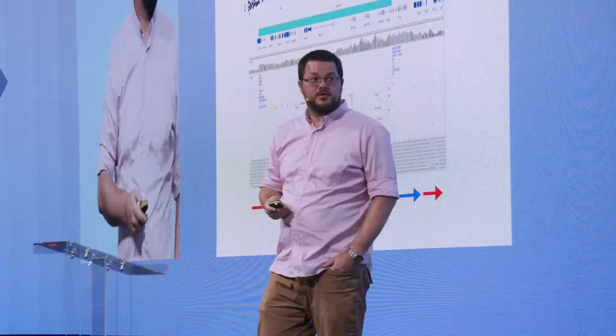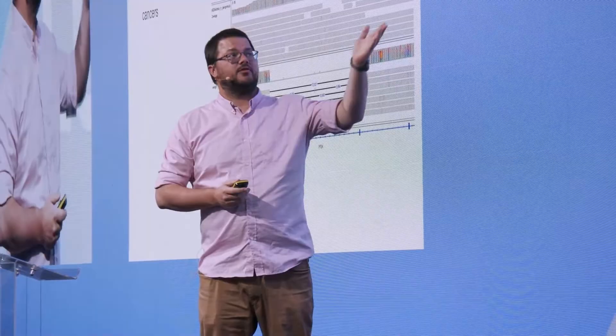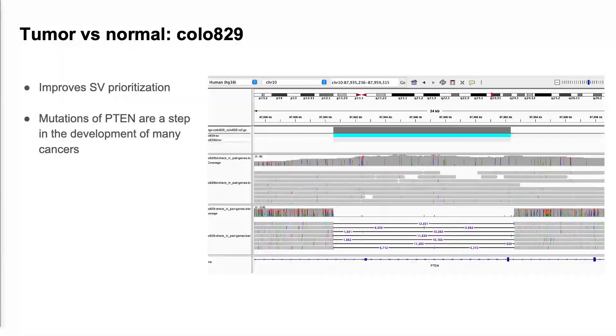Another case we are looking into is tumor versus normal comparison, using the well-studied sample COLO829. In the upper track you see the normal sample, and in the lower track the cancer sample. It takes just a couple of minutes to identify a deletion across two exons of PTEN - a really important gene in cancer research and a potential cancer driver mutation.